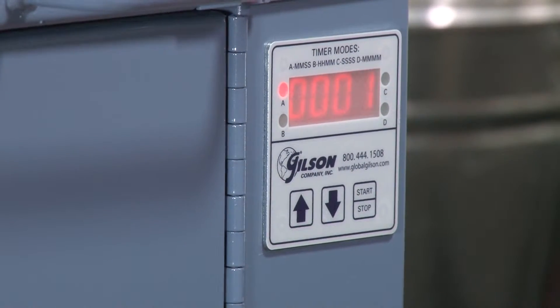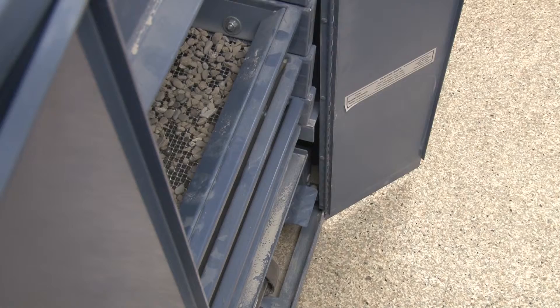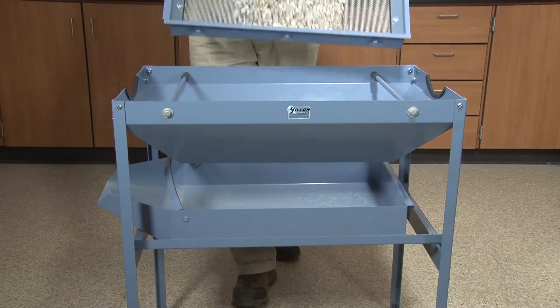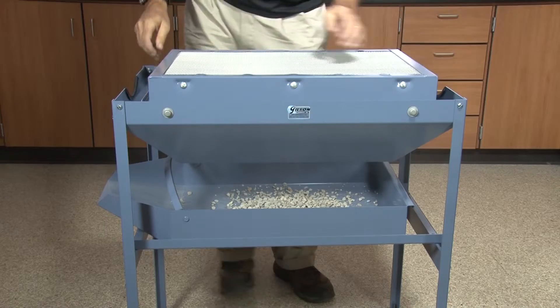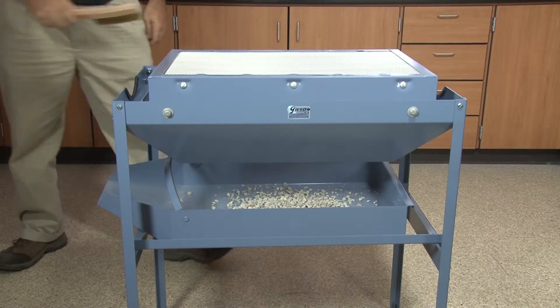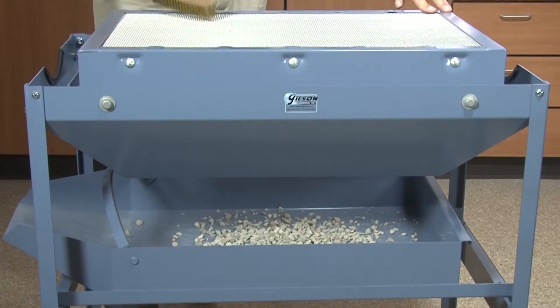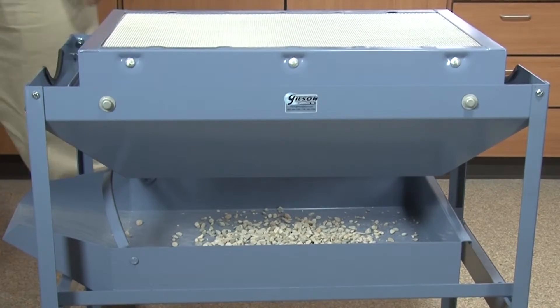At the completion of a screening cycle, remove each tray from the screen tray or test master and invert the tray and its contents onto the Clean & Weigh hopper. Gently remove all particles from the screen tray mesh, allowing them to fall through the hopper onto the handling pan below.